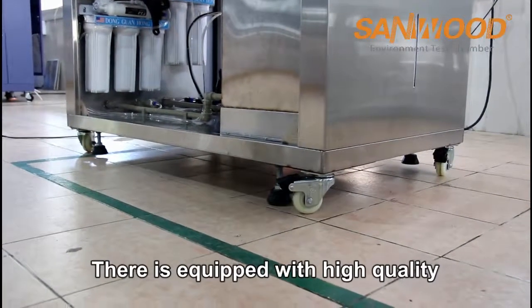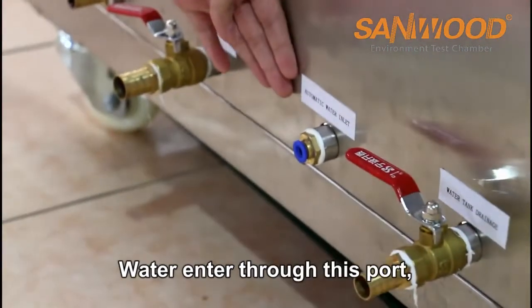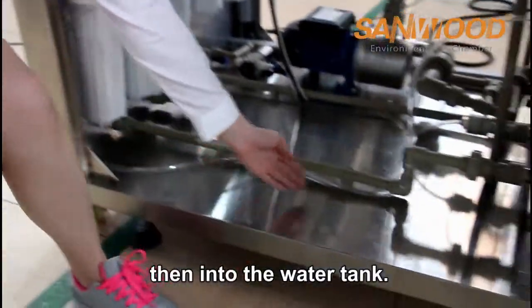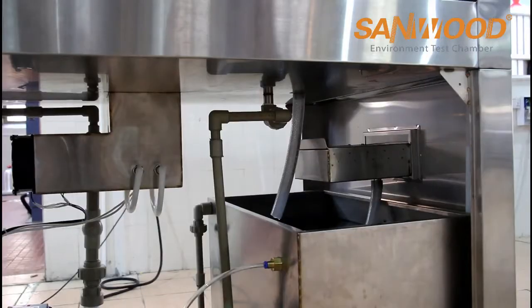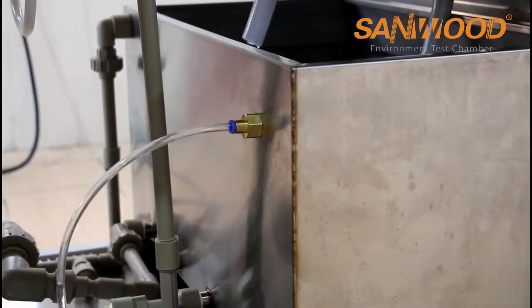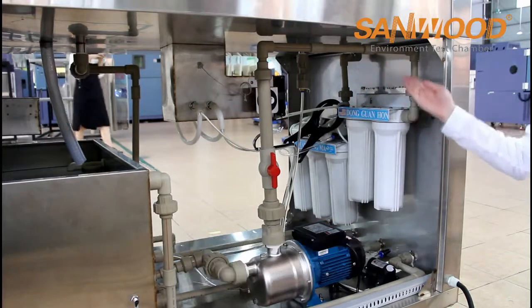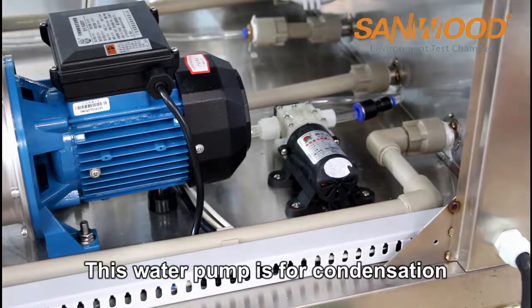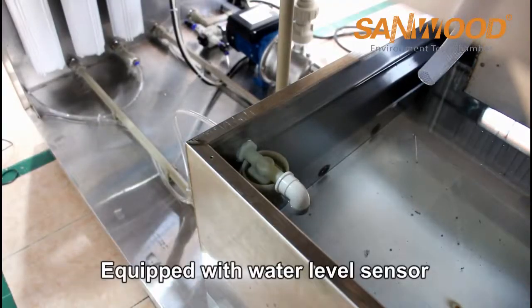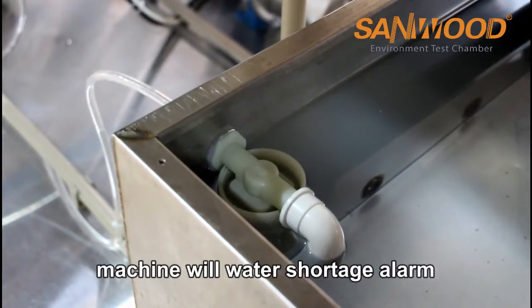The sample rack is made of aluminum alloy material. There is a high-quality PU moving caster at the bottom. Water enters through this port, then goes through the water filter, then into the water tank. This is the drainage pipe for the water sink, and this is the drainage pipe for the water tank. This water pump and this filter are for supplying rain. This water pump is for condensation. Equipped with a water level sensor — once the water level is less than the set level, the machine will trigger a water shortage alarm.